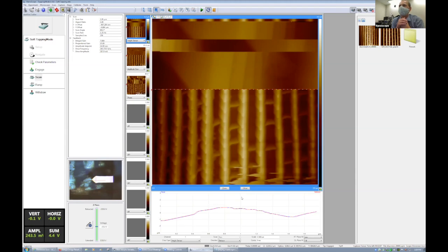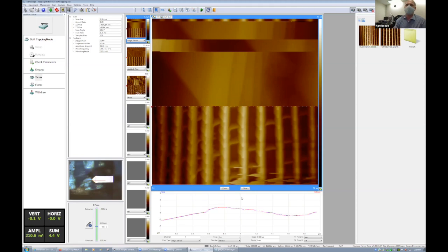But you also have long-range attractive interactions. As the tip comes closer, there's the long-range van der Waals interactions, where the 2 atoms actually try to get together a little closer. That interaction pulls the tip down when it's far away from the surface. When you're dealing with samples that are very fragile and delicate, you can actually use that force to run the AFM, where you don't make any contact with the sample, but you try to maintain that pulling force and use that to image how it changes across the sample surface. So those are the forces that AFM will feel.